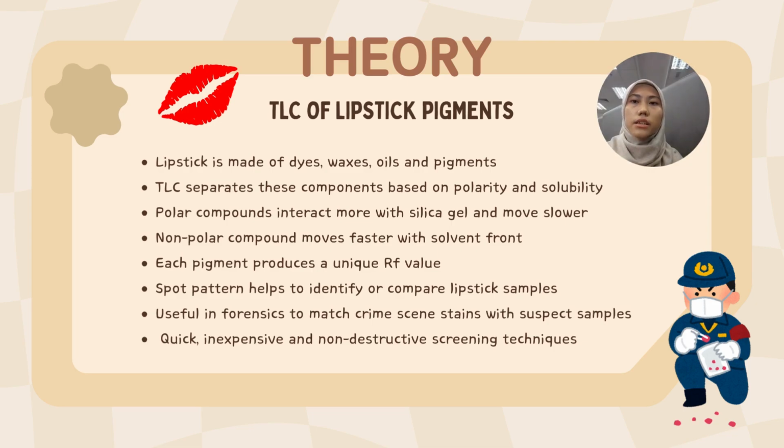Each pigment has its own unique Rf value, so we can use the pattern of spots to identify or compare lipstick samples. This technique is very useful in forensic science, especially when investigators find a lipstick stain at a crime scene. They can use TLC to match the stain with a lipstick sample from a suspect. TLC is not only effective but also a quick, low-cost, and non-destructive way to screen evidence in the early stage of investigation.